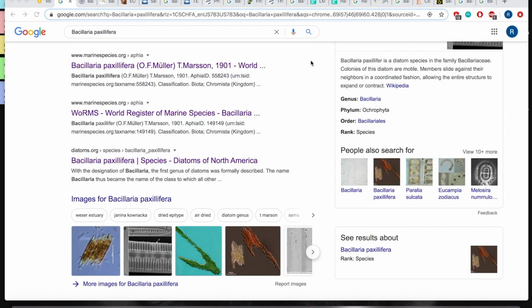Hi guys, welcome to the Diatom annotation tutorial for the microbe directory. Bear with me, it's going to jump around a little bit. Everyone has their own annotation process.